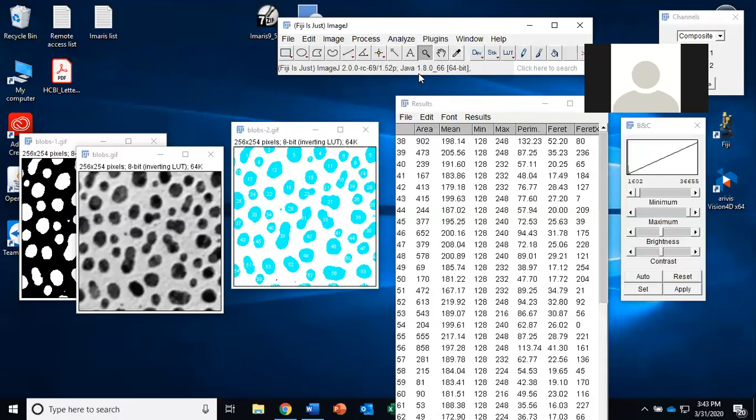One is simply doing correlations. I look at my pixel values in channel 1, and I look at my pixel values in channel 2, and are there any areas where they correlate? Are there any areas of that image where they're high in both channel 1 and channel 2? That's the way it's traditionally been done.